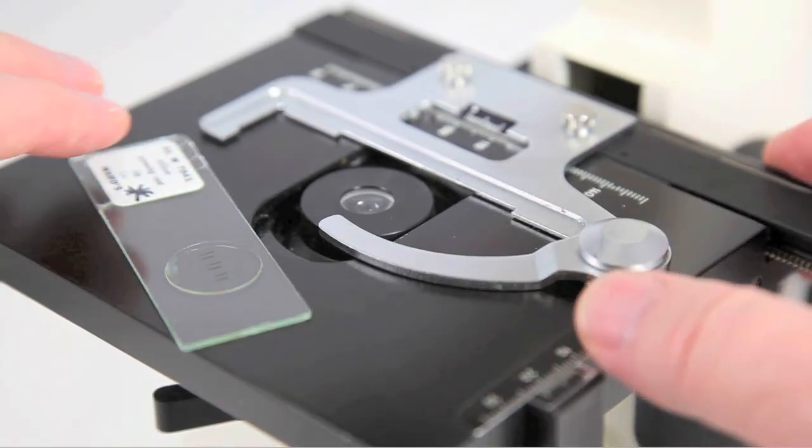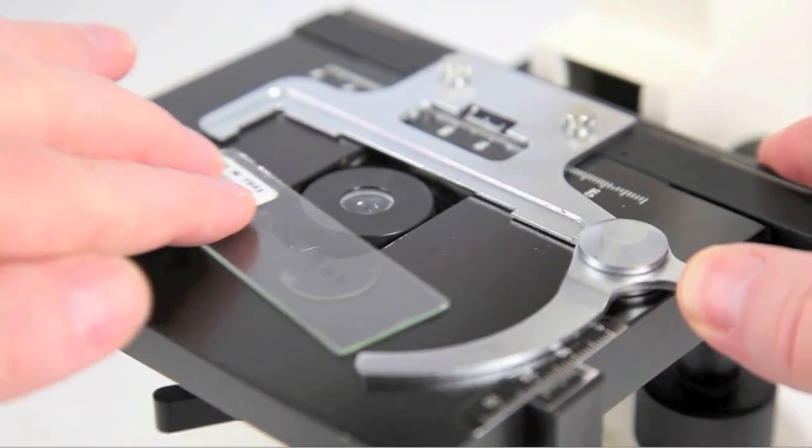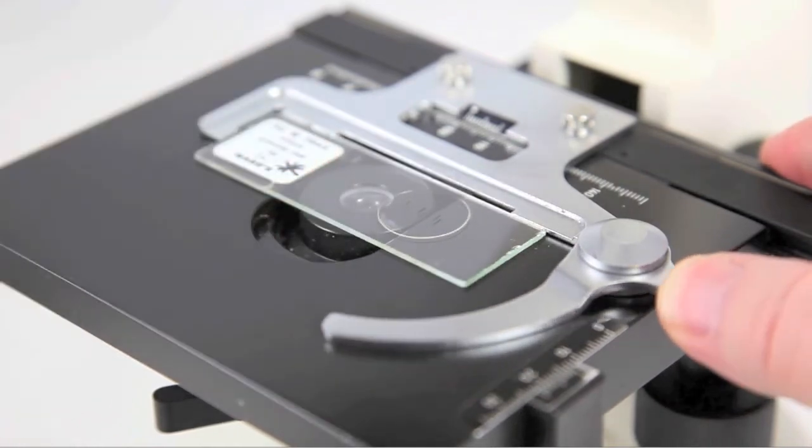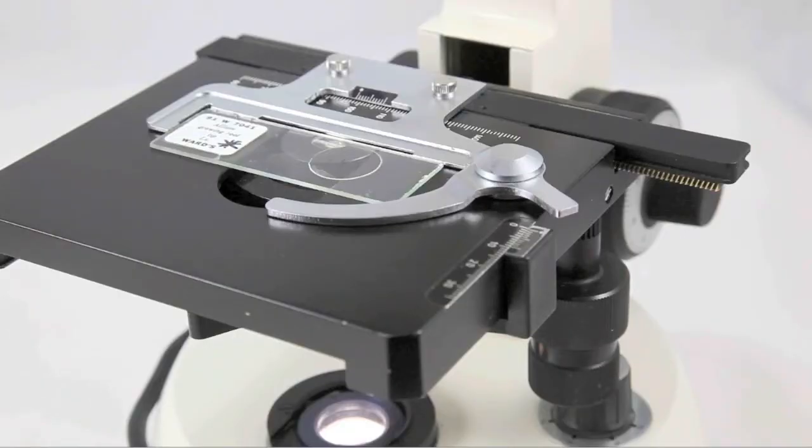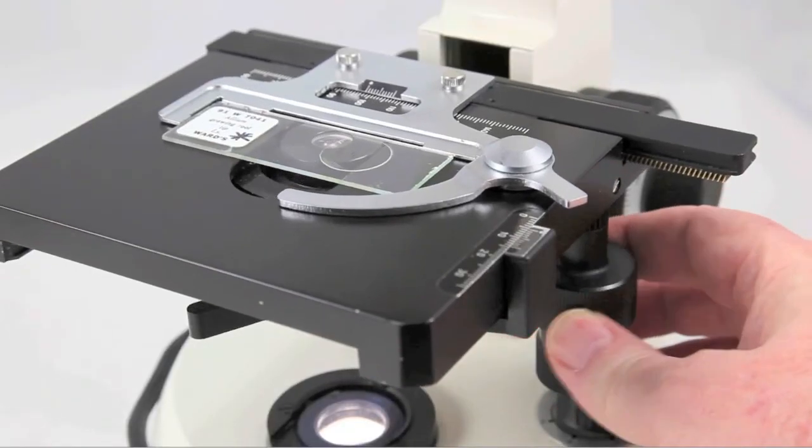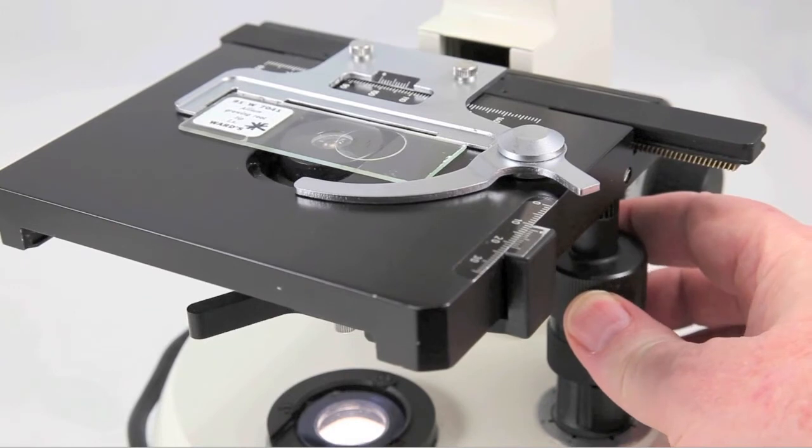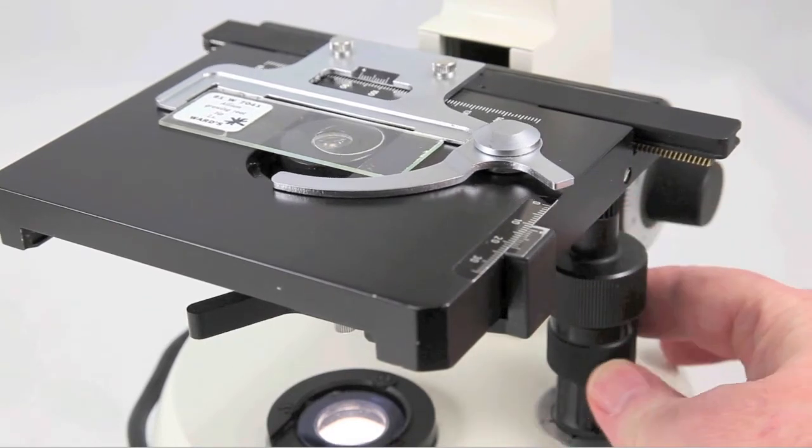Move the arm on the slide holder aside, push the slide into place, then release the arm. This will hold the slide firmly. Center the specimen on the slide over the condenser window using the mechanical stage knobs on the lower right-hand side of the stage.